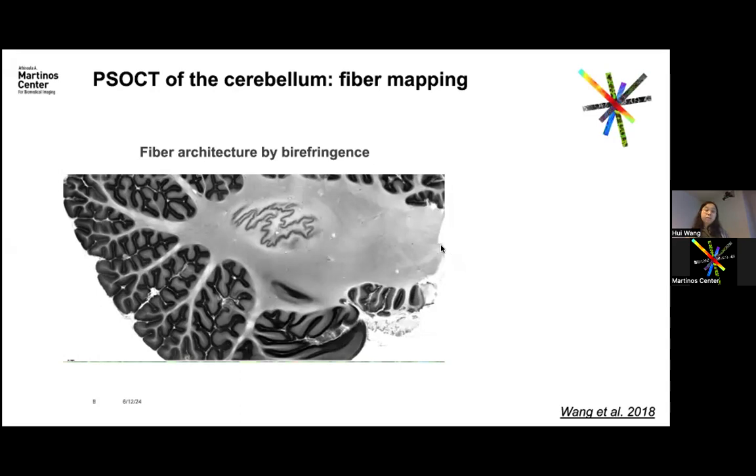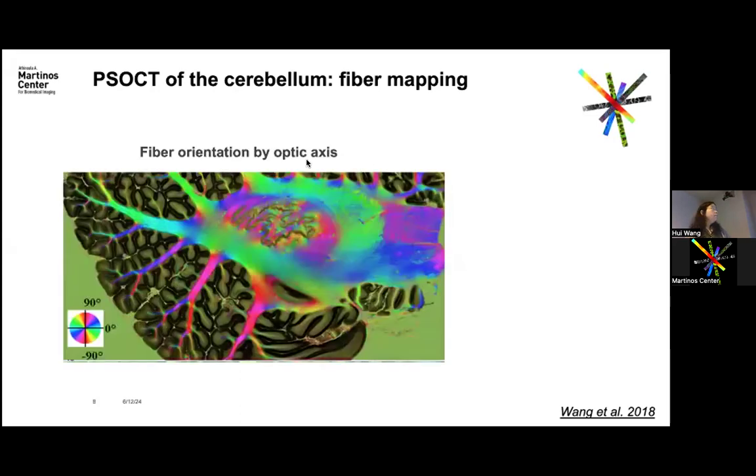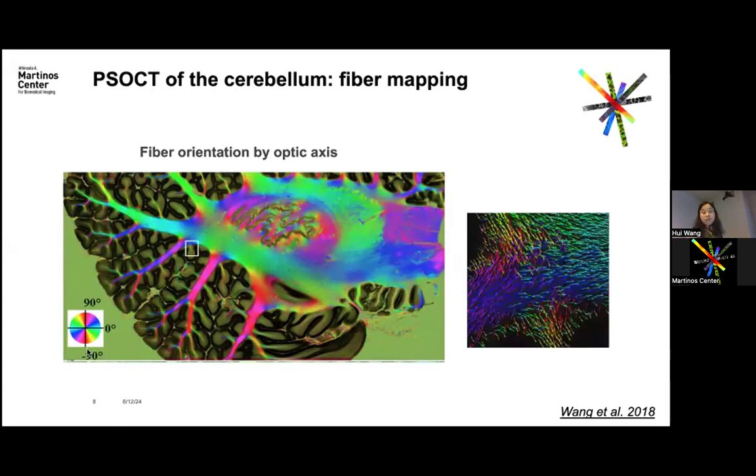Here is a human cerebellum. You can see the regions of the white matter in the middle that's highlighted by the birefringence. You can even see the fiber branches that go to individual folia. And using another contrast called optic axis orientation, resulting from birefringence as well, you see the fiber orientation in this plane. And that's explained by this color wheel. And when you zoom in on a very small region, like here, around one folium, you start to see the different orientations from the optic axis.